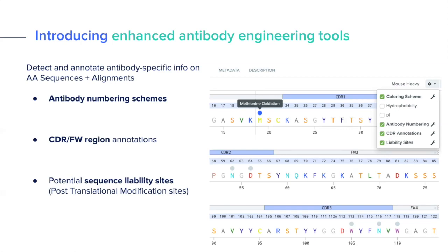Sure. For the actual assembly of, let's say, a full-length protein that has both a heavy and a light chain in it, rather than doing a two-step assembly with backbone and insert one, having both fragments in that, you would do backbone, insert one, insert two, where insert one is either your light chain or heavy chain, and insert two is your light chain or heavy chain, depending on what you pick for the first one. If there's a full-length protein that has an amino acid sequence with those two concatenated together in Benchling, and Benchling during the auto translation run can read the codons from start to finish and create a matching amino acid sequence, that will work. But it does require some curation or a reference amino acid sequence to go off of. And the assembly strategy would look somewhat different.